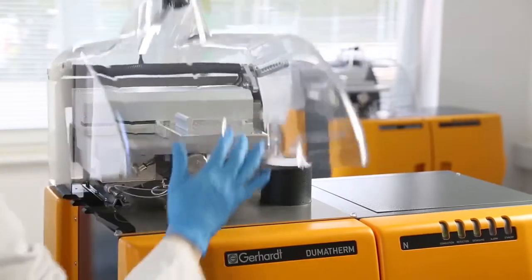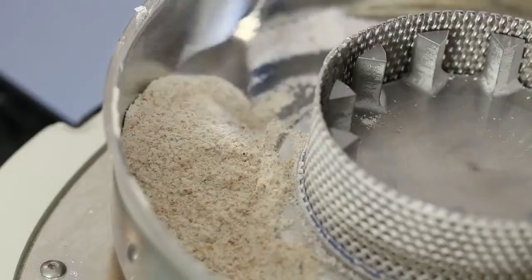Dumatham's core component is the high-temperature reactor. Here the sample combusts in seconds with only a small amount of oxygen required, thanks to our chrome-free catalyst and leaving virtually no residue.